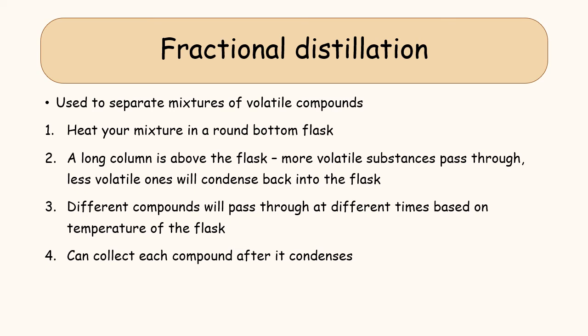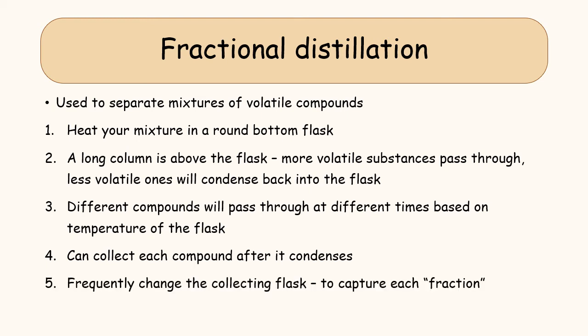And what this allows you to do is collect each compound after it condenses. And you can use the thermometer to check the temperature of the gas as it's entering the condenser so that you could tell what compound it is.